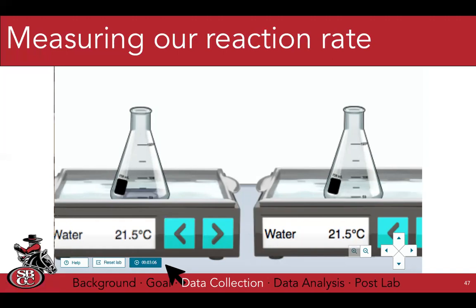If you're looking really closely at this flask, it flashes orange before it starts turning black. I think it's just a product of the HTML programming. It's not a big deal, but it's an indicator that the computer has told you it's reached the endpoint. You wouldn't necessarily get that in real life, but at the same time, you would get, as we saw from the video, a much clearer black solution.